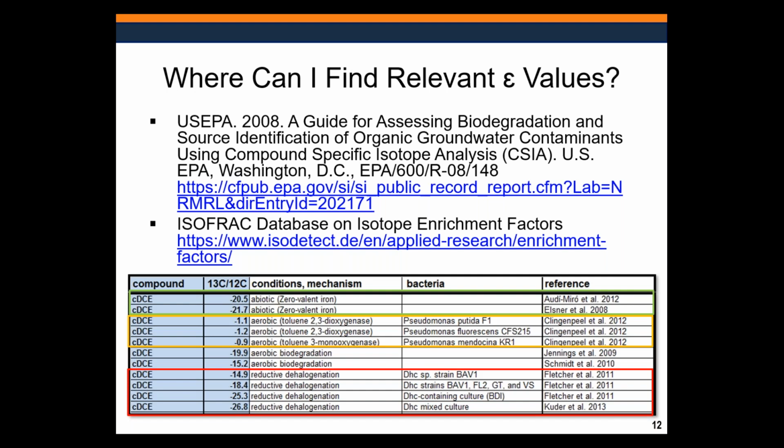Now, talking to Dora earlier, she also mentioned that for those of you that do isotopic analysis through Microbial Insights, and they do all of this, they have their own database that will allow you to look at these enrichment factors, and it's updated currently. So it's similar information to this ISOFRAC database, but runs right up through 2020, and they're happy to turn you on to that if you do your isotopic work with MI.